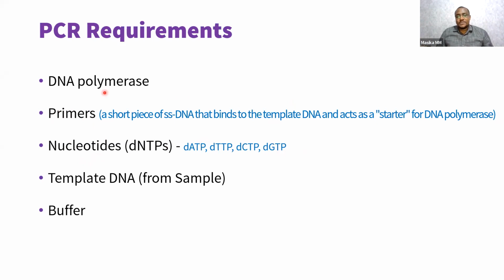In essence, this polymerase will require dNTPs, or deoxynucleotides. Deoxynucleotides are basically nucleotides that are in all accounts similar to the ones we have in the body, and they are used to make DNA. That's why they're called dNTPs. But I think during sequencing, I'll show you some of the differences so that you understand how modifying these bases can help us with our tests.